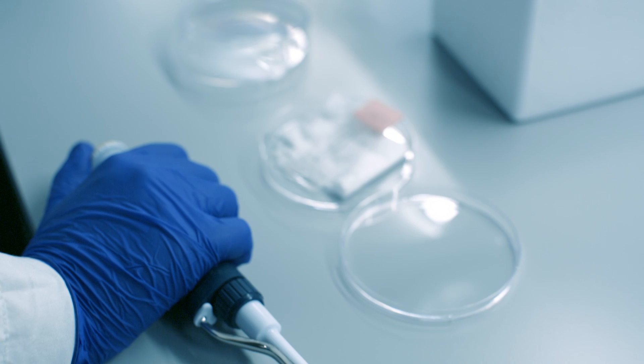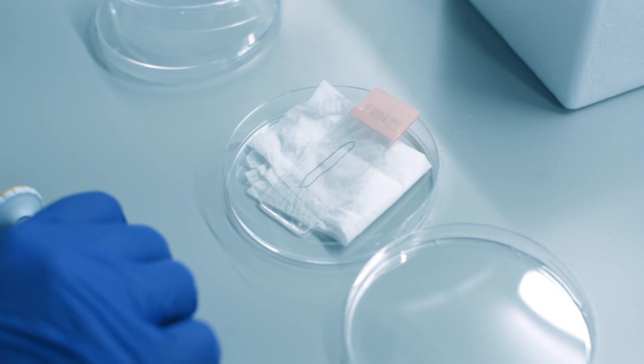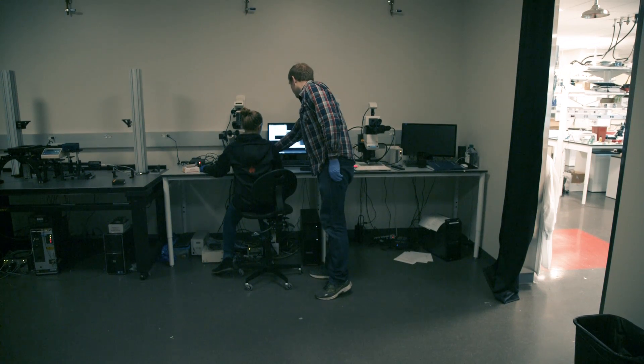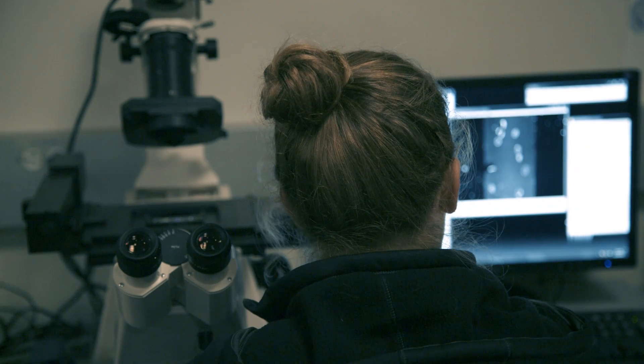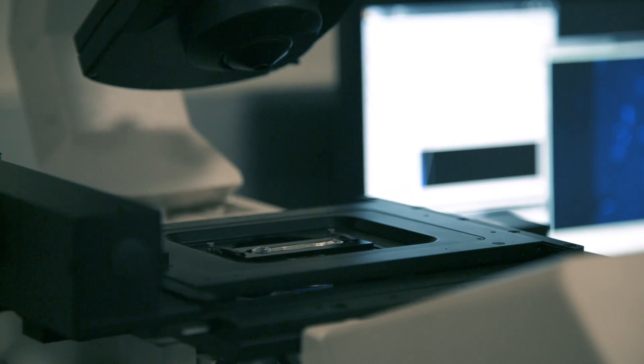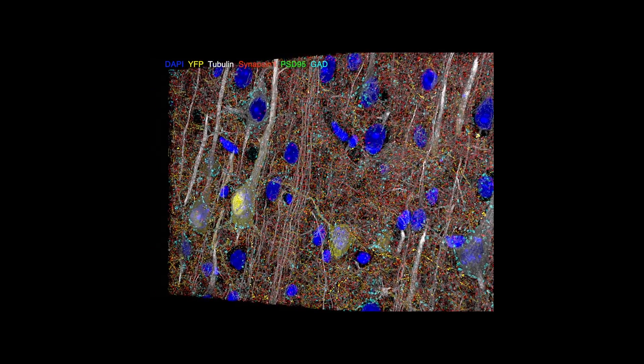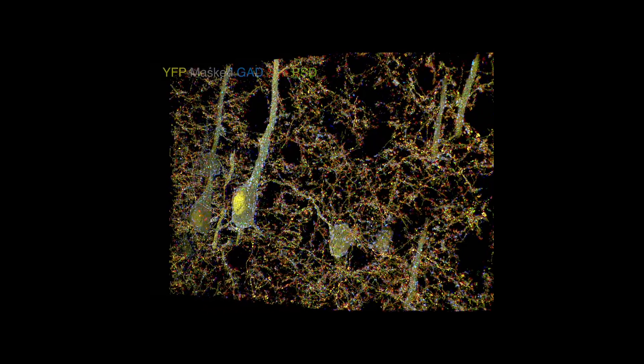We apply a set of immunohistochemical stains — antibodies. One antibody will recognize one molecule; a different antibody will recognize a different molecule that we're interested in. We stain those sections, take them to our fluorescence microscope, and take pictures of each of the sections — multiple pictures of each. Then in the computer, we take all those images and reassemble them into a volume, giving us a very high resolution, detailed picture of the tissue and all of the molecules we've been able to find.